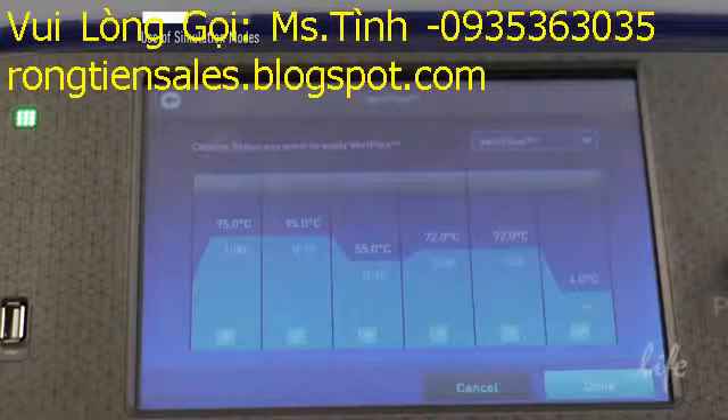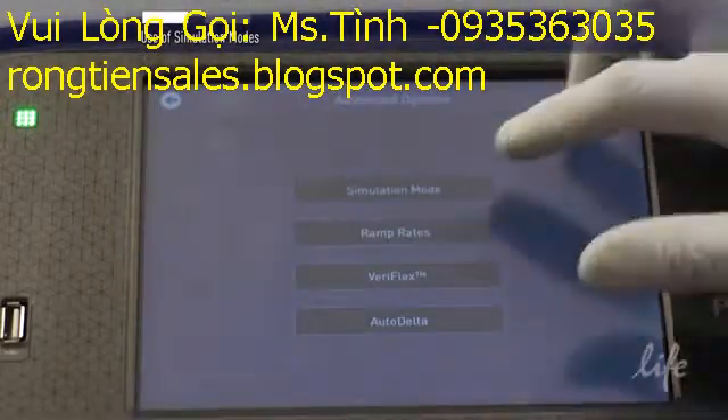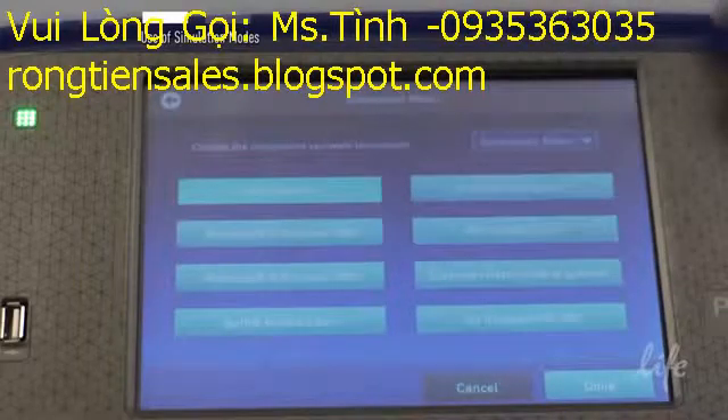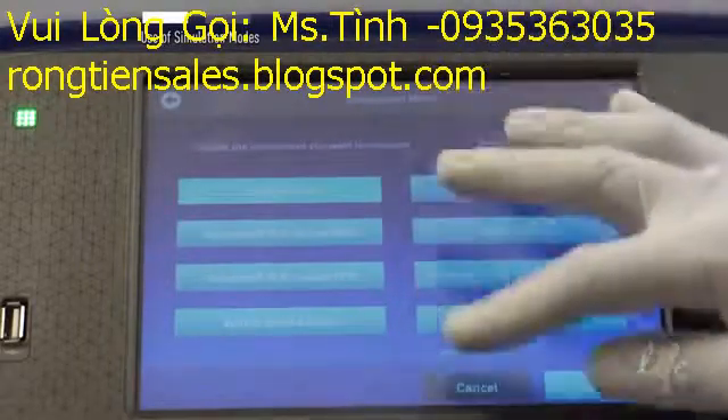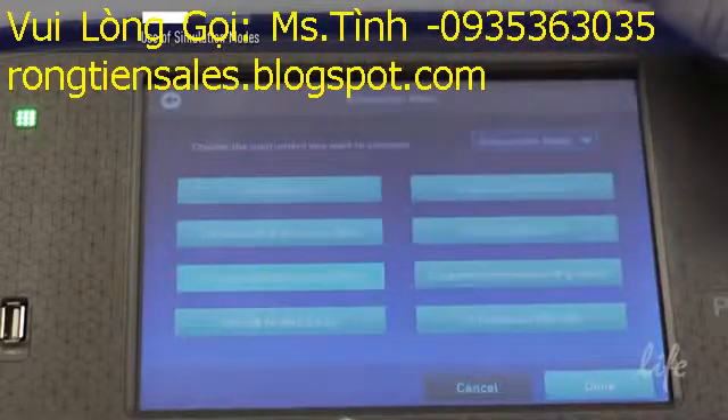In addition, you can program ProFlex to simulate the ramp rate of an old instrument. From the Advanced Options menu, press Simulation Modes and select the instrument you are interested in simulating. Save your method if you are interested in accessing these conditions later.